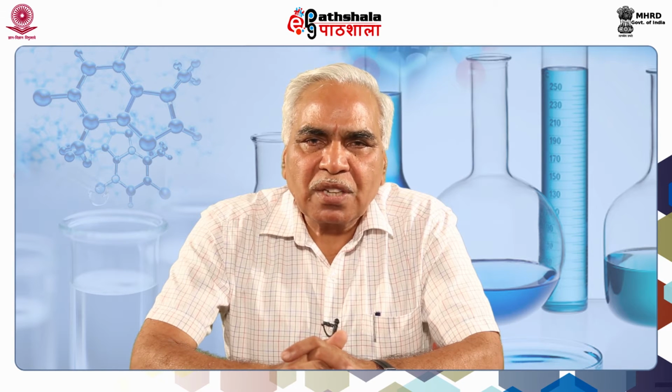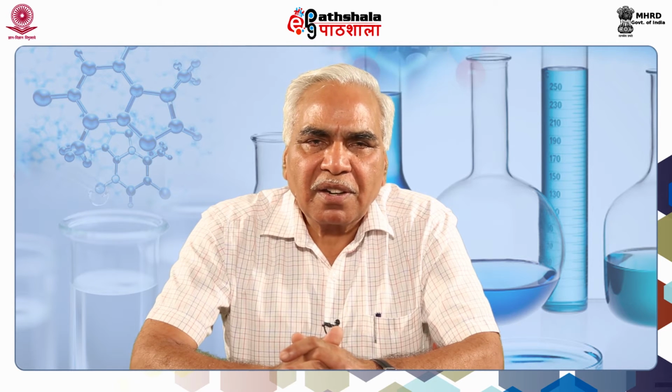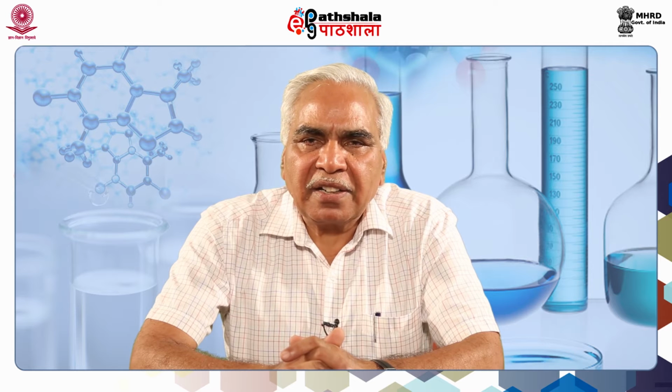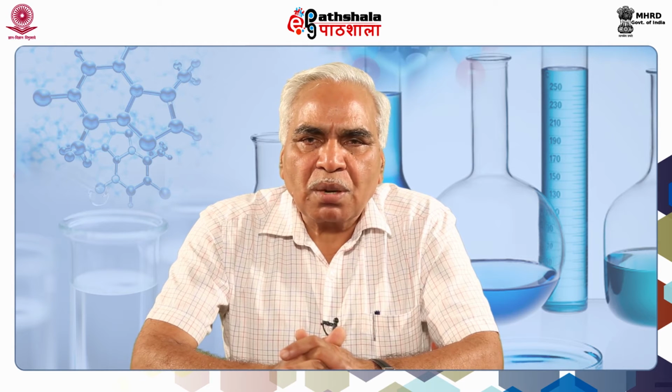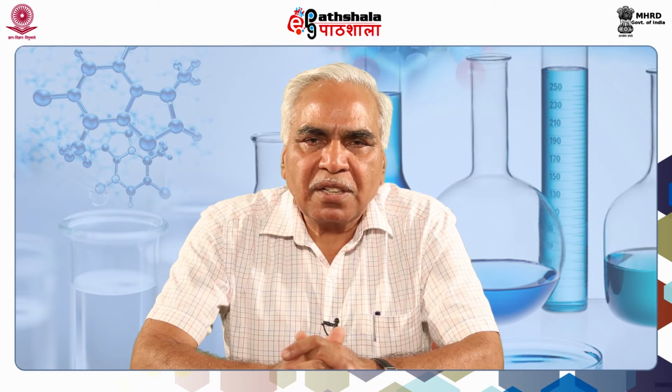This is the concept in blotting techniques, where molecules separated on a gel are transferred to a membrane for their subsequent analysis. Edwin Southern in 1975 transferred DNA fragments separated by electrophoresis to a membrane, and the molecules of interest were detected by a probe which was hybridized with the membrane.